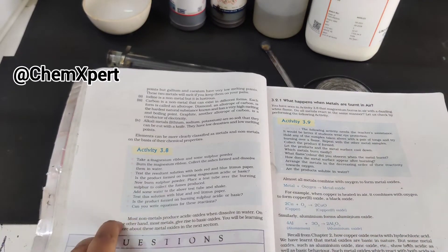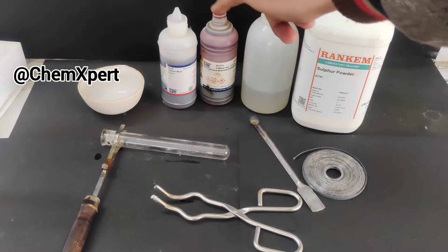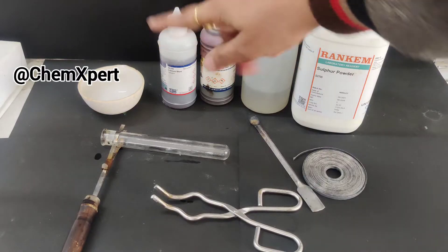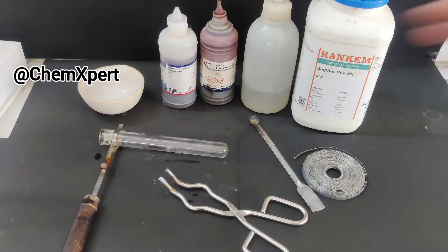For this we require magnesium ribbon, sulphur powder, water, blue and red litmus, a china dish, a pair of tongs, a spatula, and a holder fitted with a test tube.